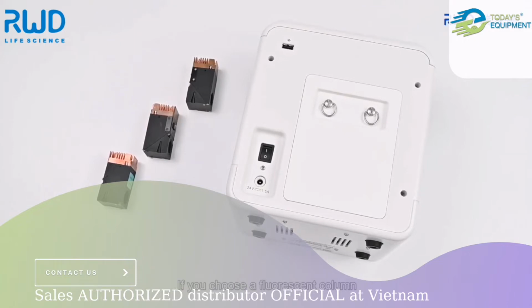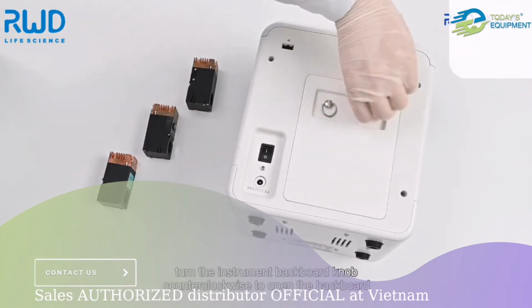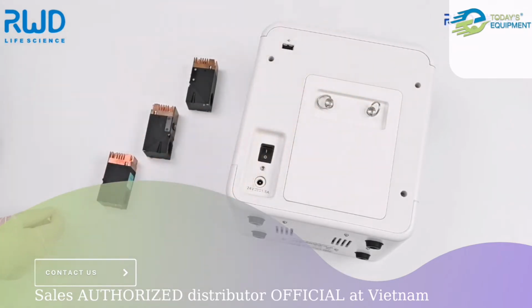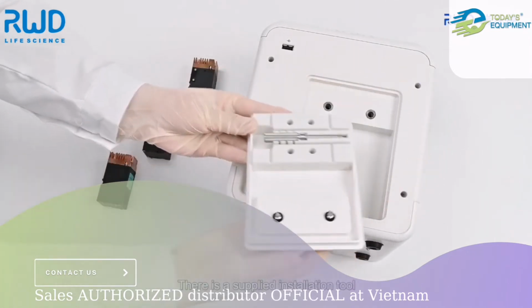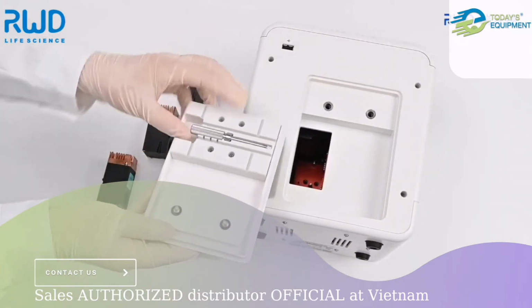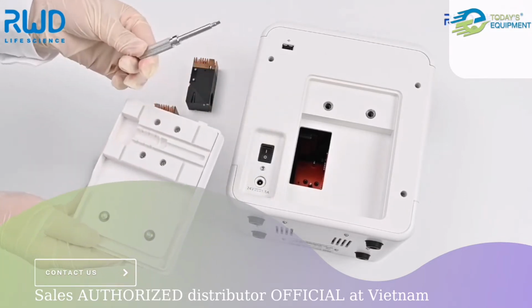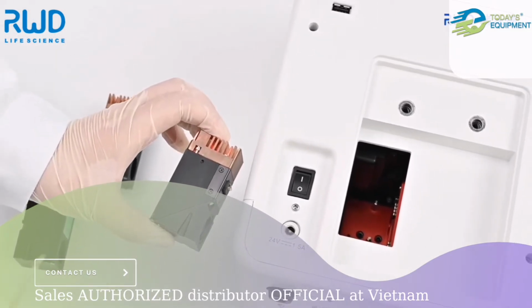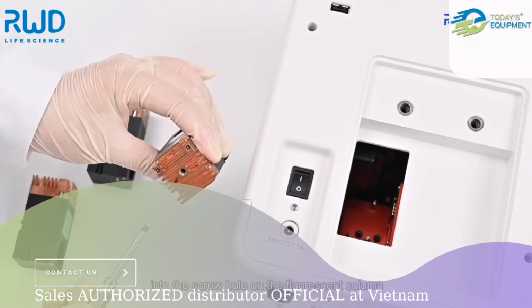3. Installation of fluorescent column. If you choose a fluorescent column, you need to install or replace it. First, turn the instrument backboard knob counterclockwise to open the backboard. There is a supplied installation tool on the back side of the backboard. Screw the installation tool into the screw hole on the fluorescent column.